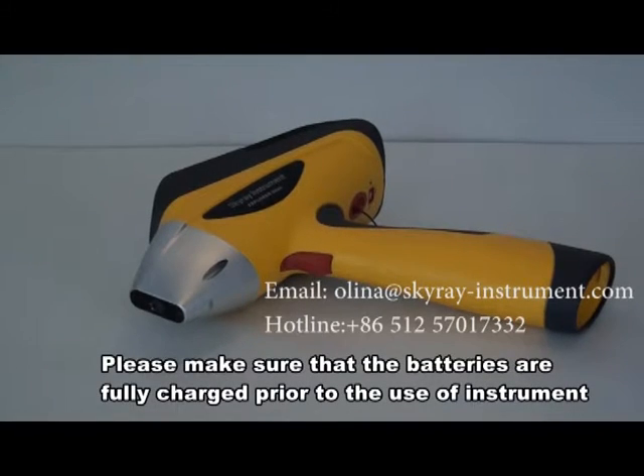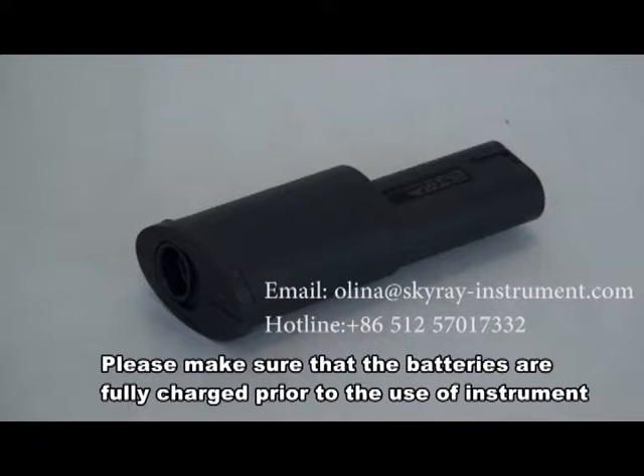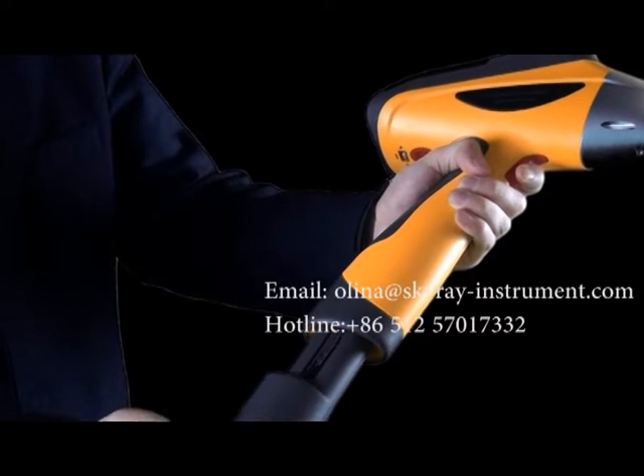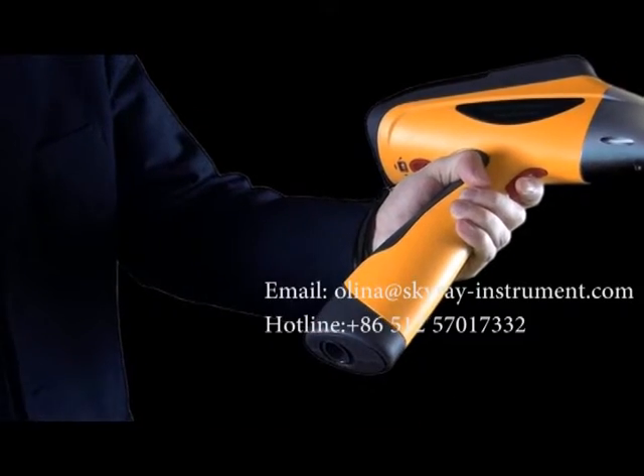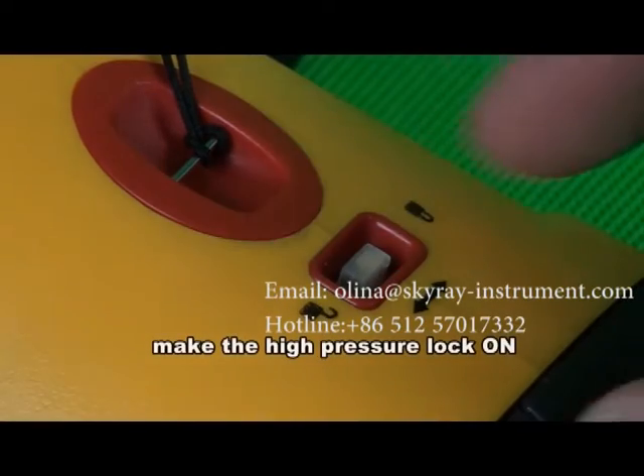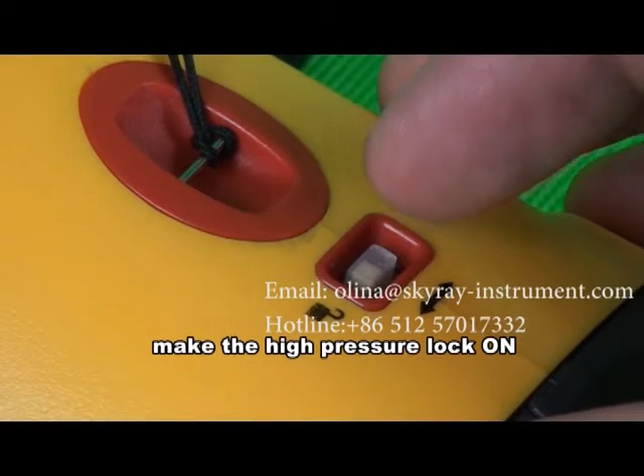Please make sure that the batteries are fully charged prior to the use of the instrument. After the instrument is removed, insert the dedicated batteries into the bottom of the instrument and make the high pressure lock on.